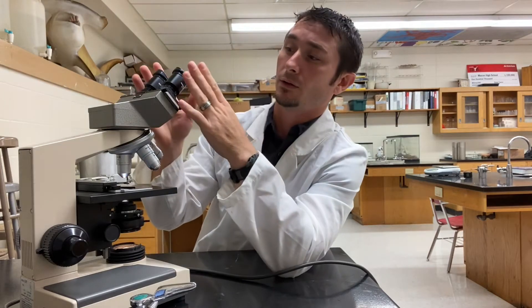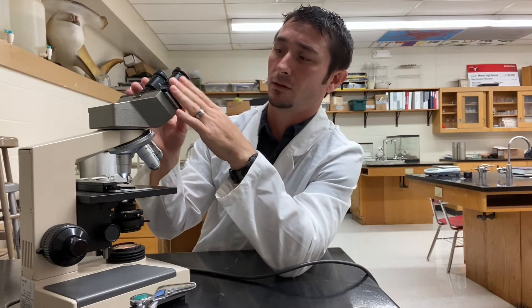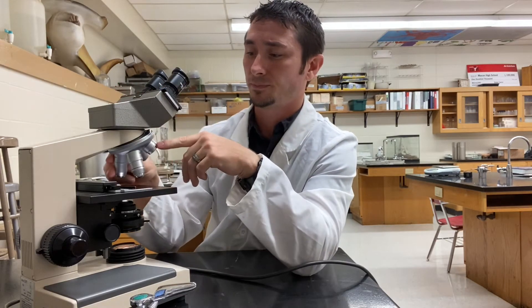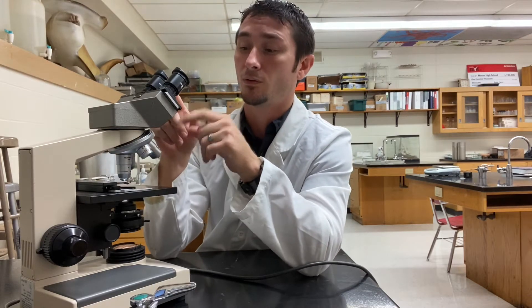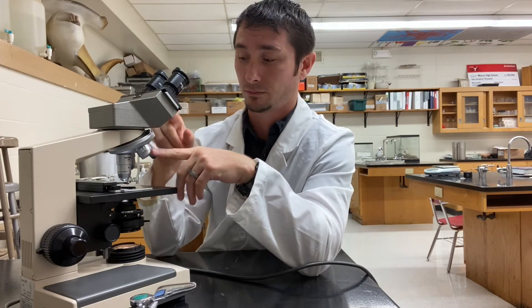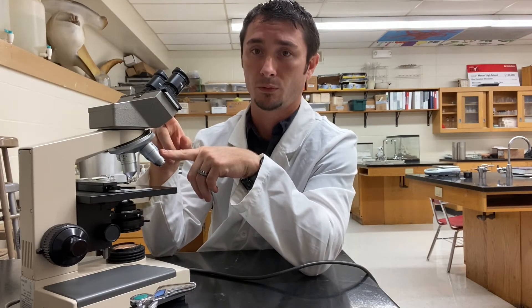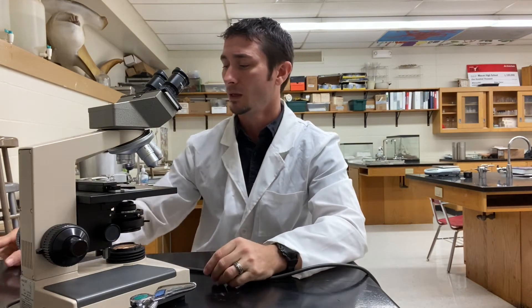The eyepiece and eyepiece tube actually have a magnification of 10x as well. So the very first objective says four times your normal vision — but four times ten is 40. The 10x objective times ten is 100. And the 40x objective gives you 400 times your normal vision. It's a big difference as you go along.